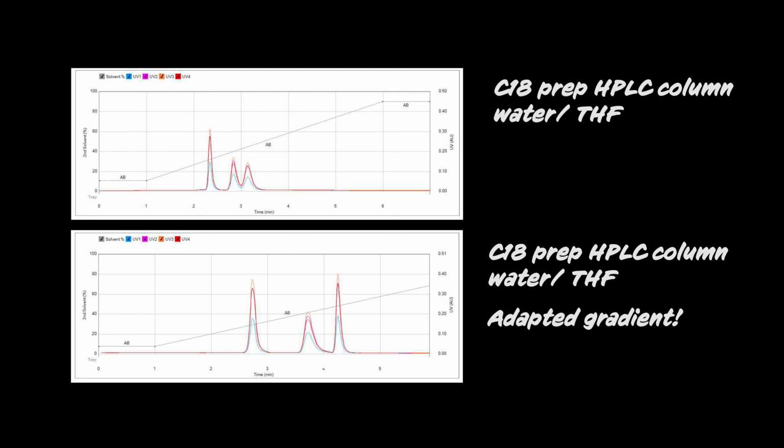Let's switch to another important topic, viscosity. Viscosity describes solvents' resistance to flow. Consequently, solvents with low viscosity are favored as they minimize the cartridge's back pressure.